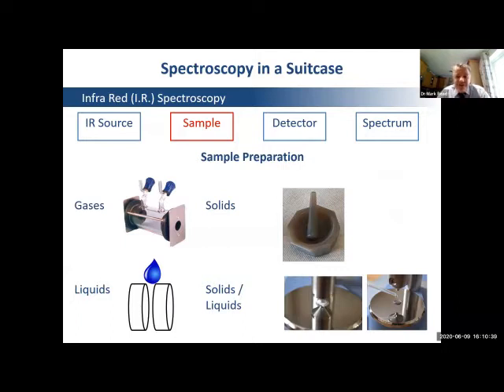Infrared spectroscopy is a very versatile technique because we can analyze gaseous, liquid, or solid samples, just by changing the sample head. Now, we're only going to look at liquids and solids today, because to analyze gases, I'll have to reconfigure the instrument.